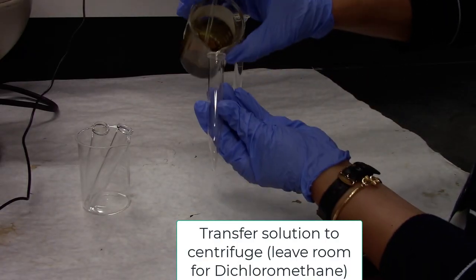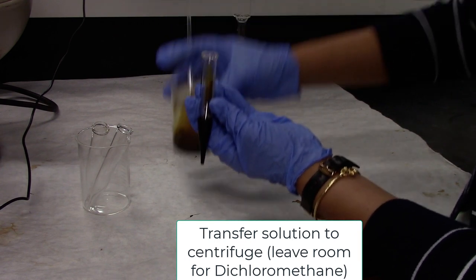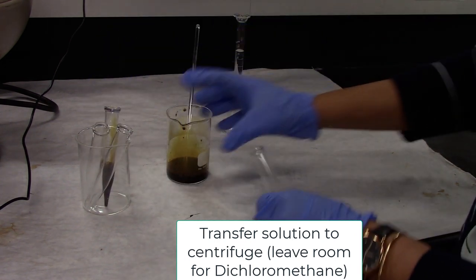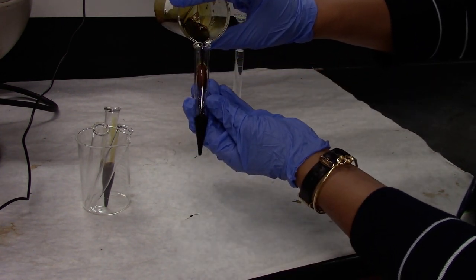Transfer the coffee solution into 3 to 4 centrifuge tubes, fill about halfway through so we can leave some room for dichloromethane or DCM.